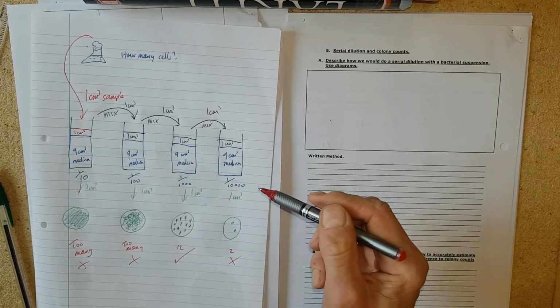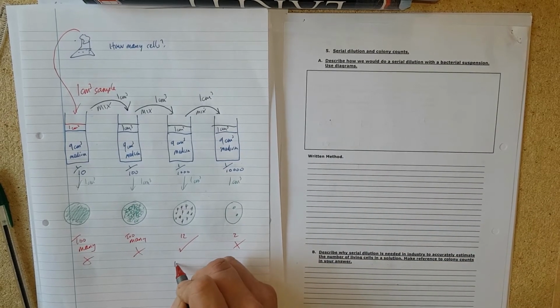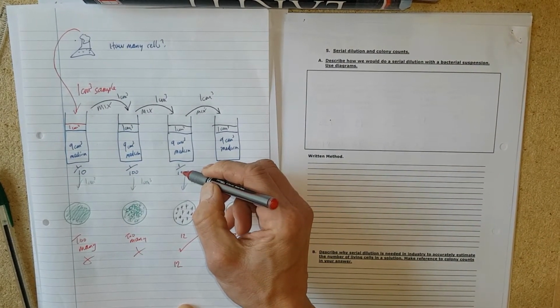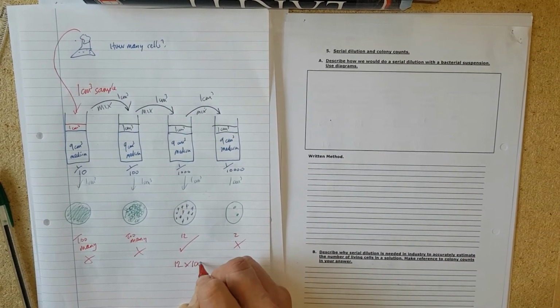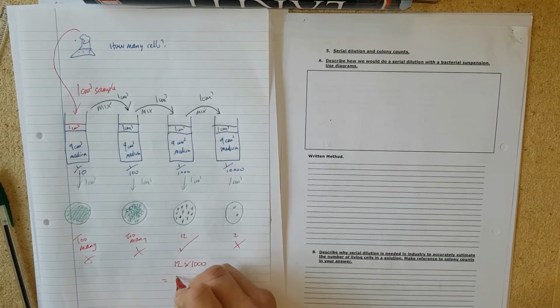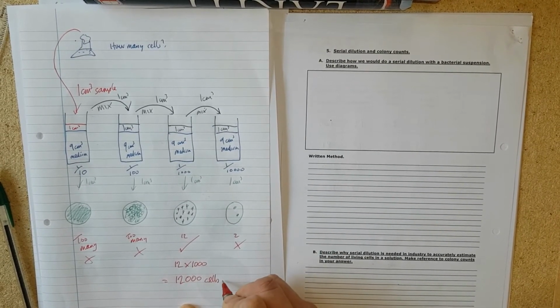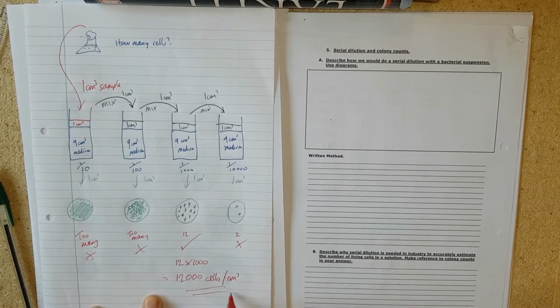And the maths that I need to do is, I've got my 12, but I've got this 1,000 dilution that I need to take care of now. So it's going to be times by 1,000 equals 12,000 cells per cm cubed. And that's going to be my final answer.